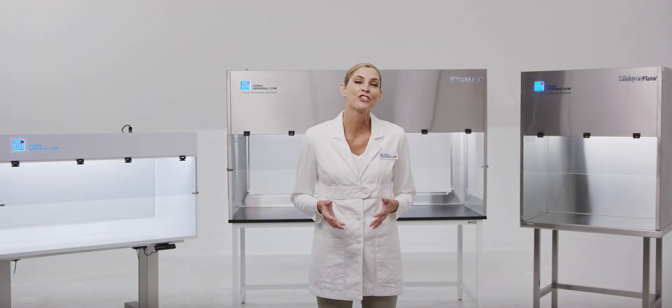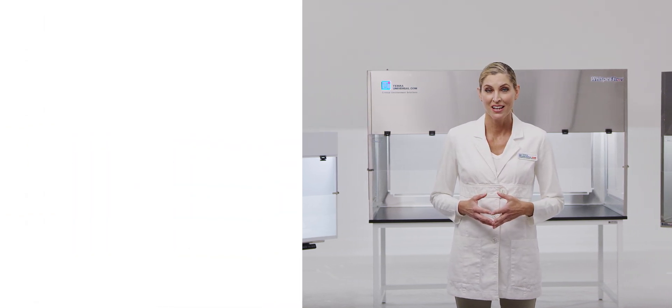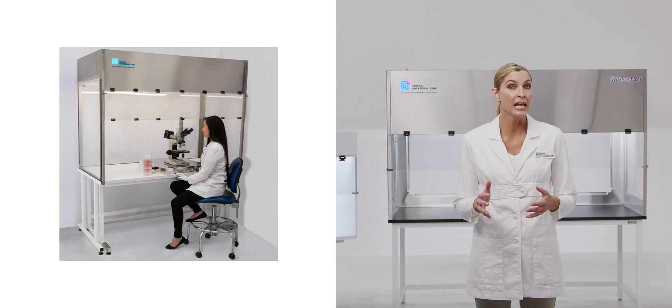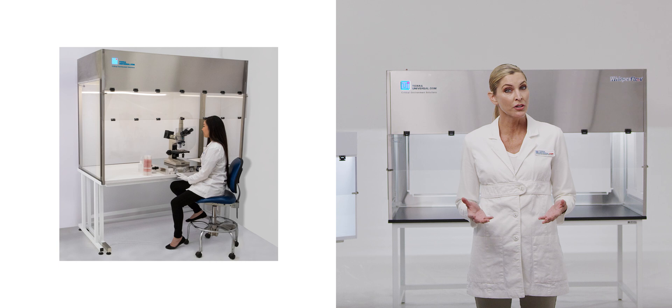Tara manufactures and stocks WhisperFlow hoods in a variety of configurations. Tara's WhisperFlow High-Clearance Benchtop Hood is designed to accommodate bulky analytical equipment, such as HPLCs or overhead stirrers.